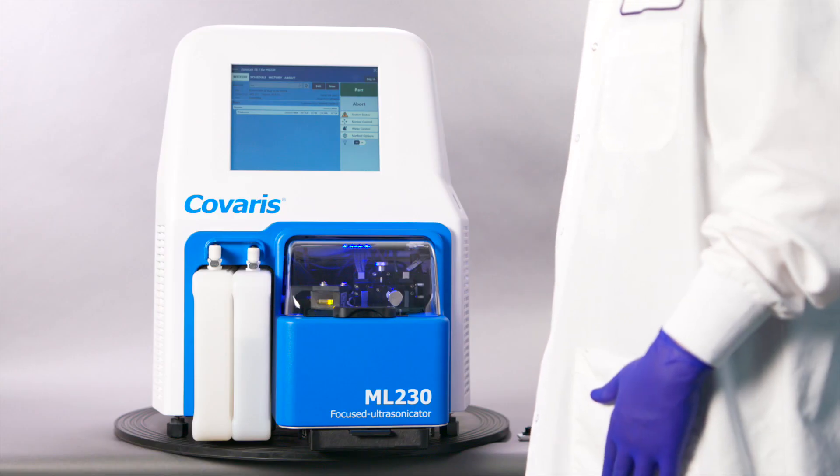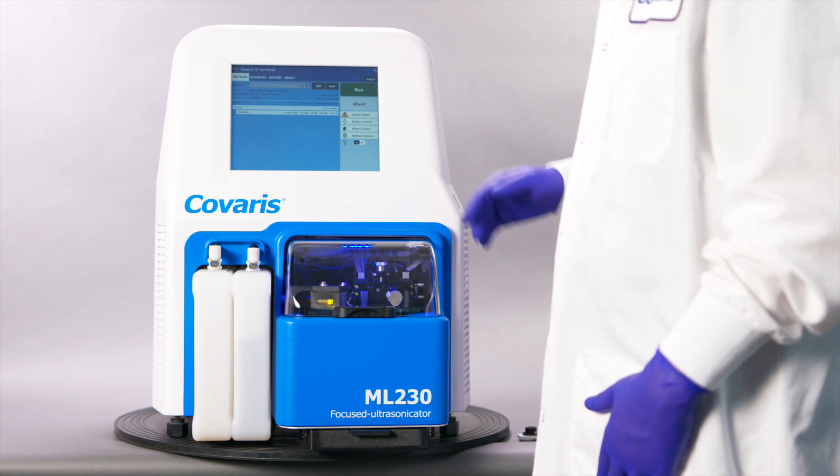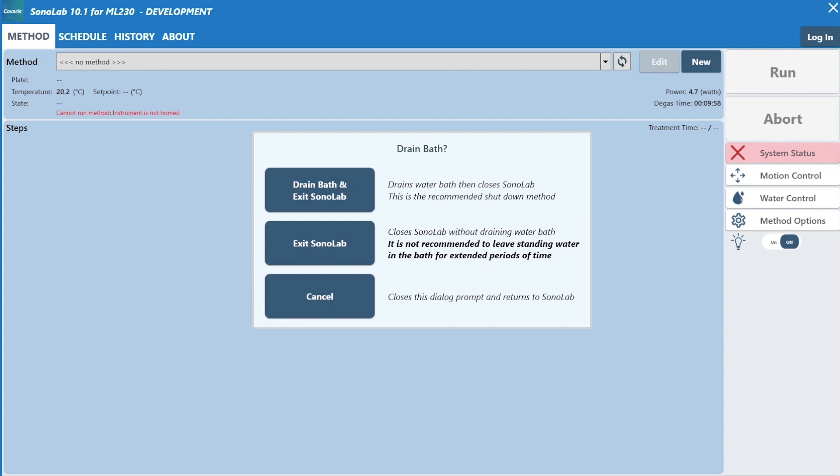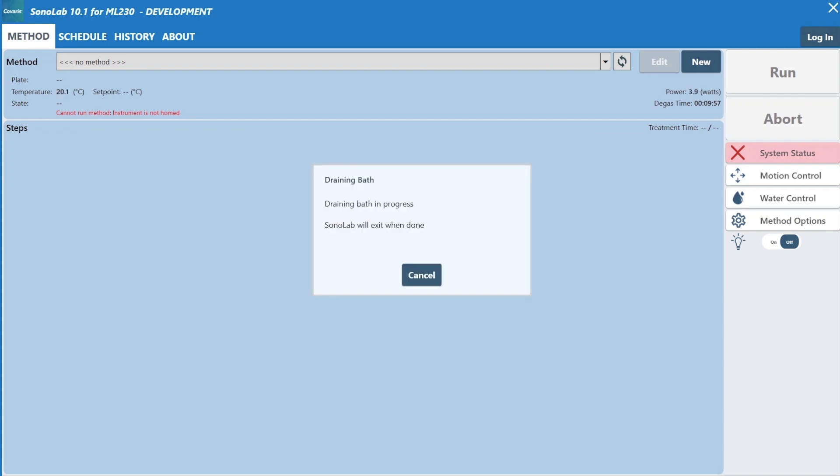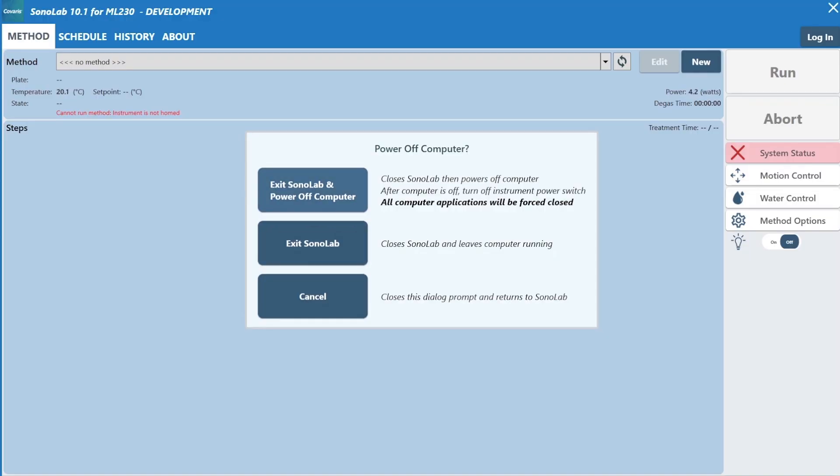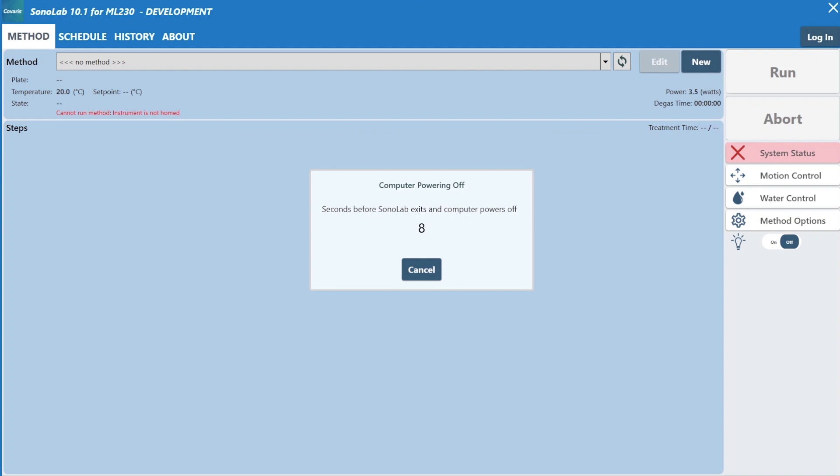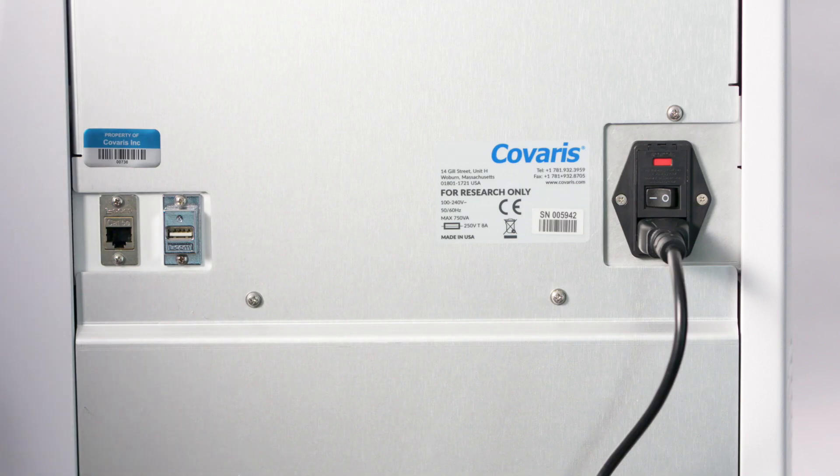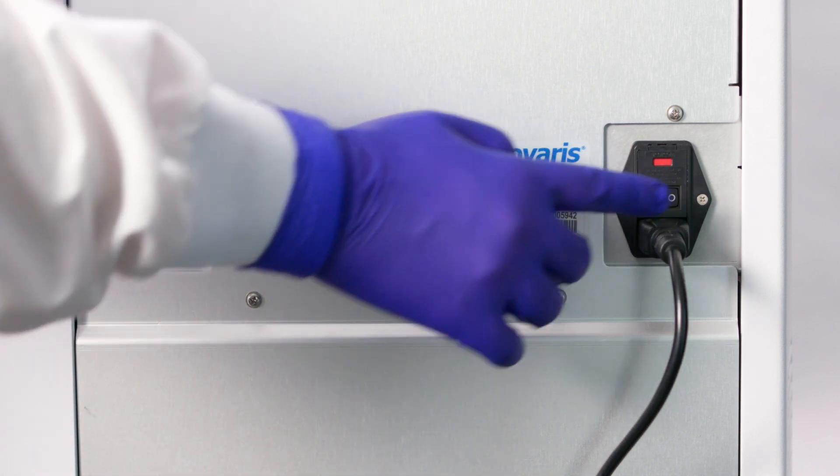To properly shut down the ML-230, exit the Sonolab program. This will also prompt you to empty the water bath. Press Drain Bath and exit Sonolab. This will prompt a message letting you know the bath is draining. Once the bath has finished draining, a new window will appear and you can select the option to exit Sonolab and power off computer. Once the operating system has been shut down, users can turn off the ML-230 by moving the power switch to the off position.